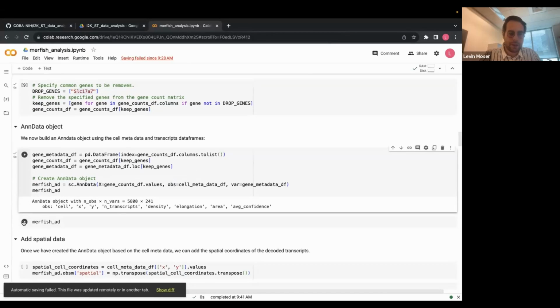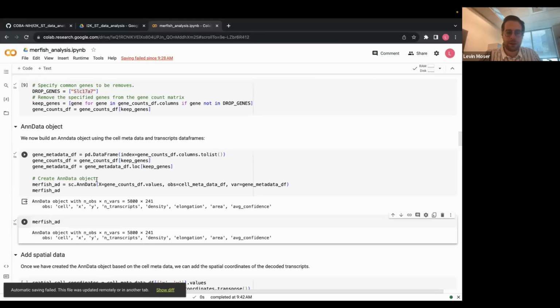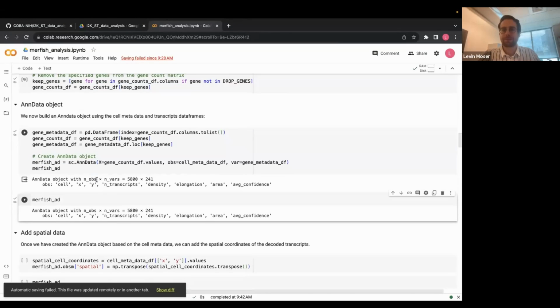What is almost the coolest thing about AnnData in general, as we're going to see, is that this is now the object where all our data lives. In contrast to many other analysis pipelines for different packages, like imaging or whatever, we are never going to extract information out of it. We're only going to add information to it, and you will see that in a second.